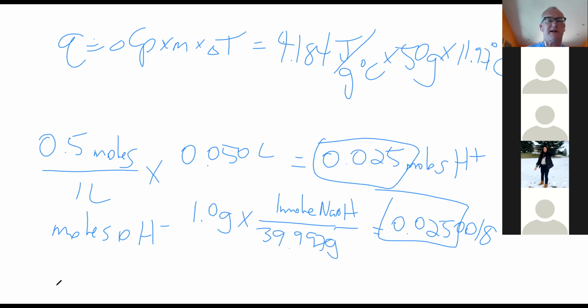All right, so what's my Q this time? 2505.9195. Really? It should be more than that, shouldn't it? Let me calculate that again.